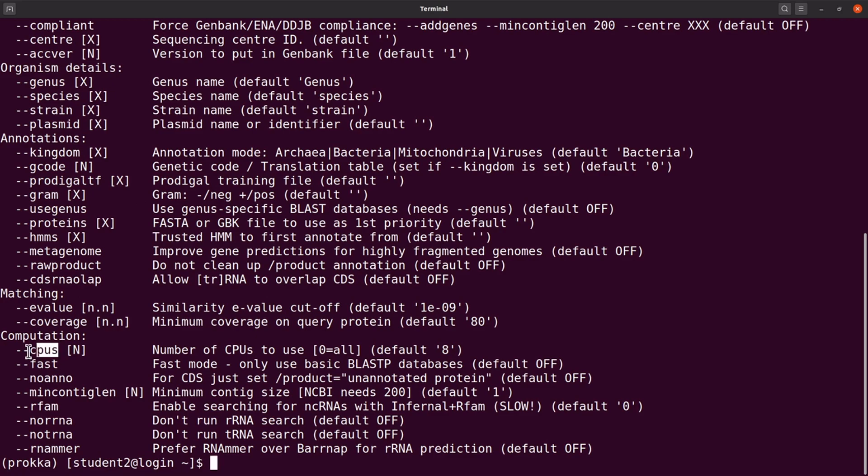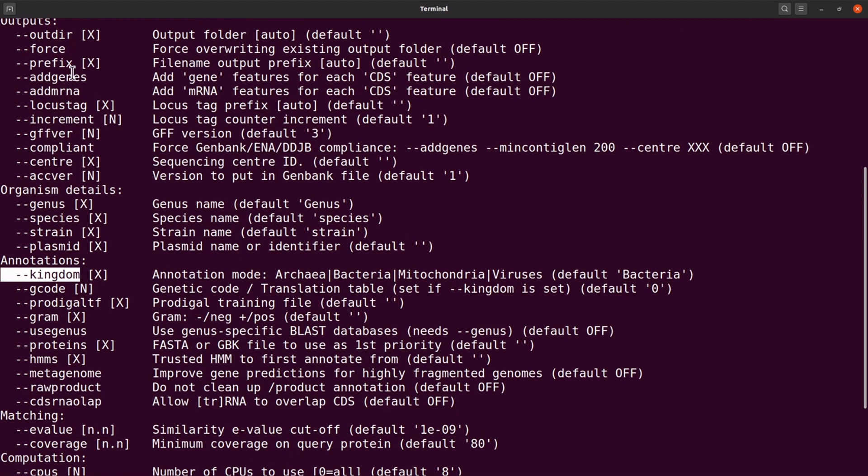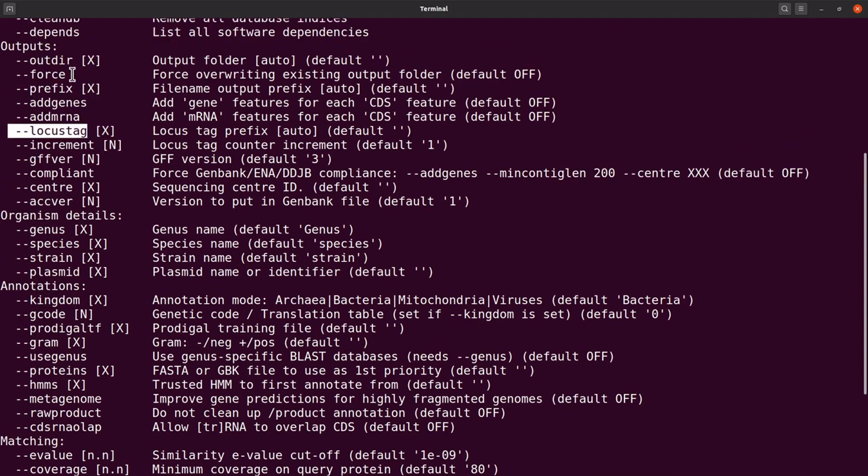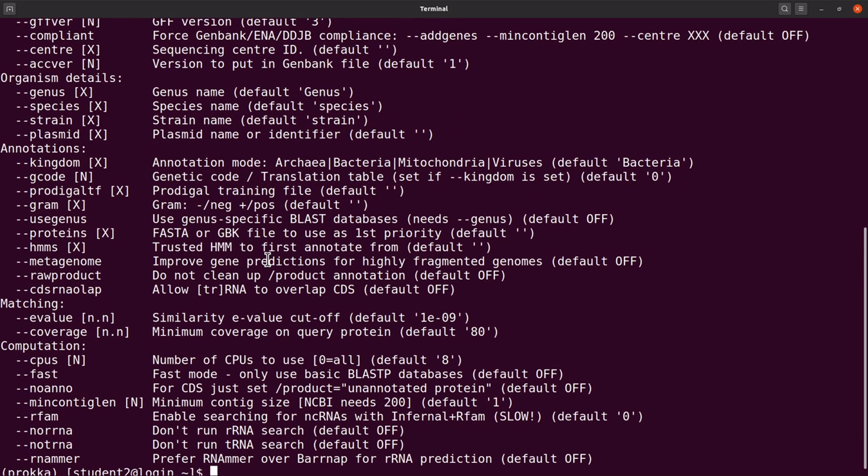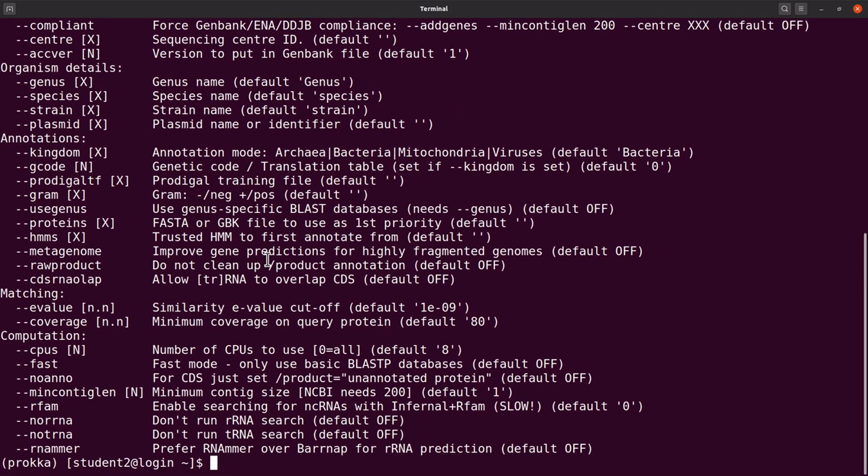We'll use the cpus, we are also going to use kingdom, we are also going to use the locus tag which is here, and we are also going to use the prefix which is here. These are the options we are going to use for this exercise, but you can explore these other options.